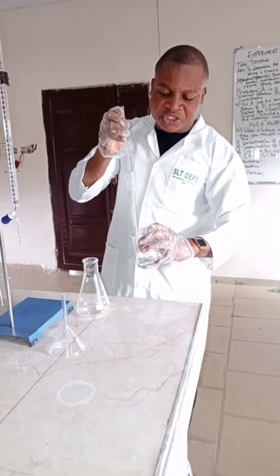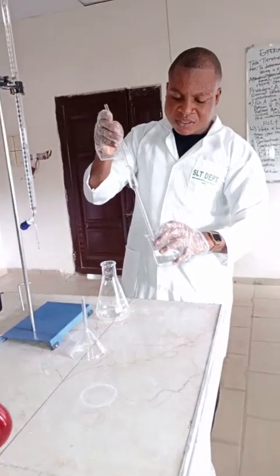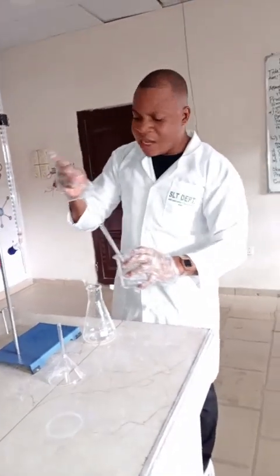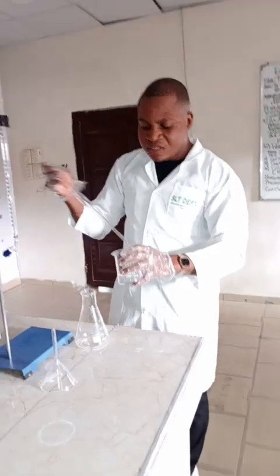Please, one of the precautions you need to take while pipetting is to avoid air bubbles within the pipette.